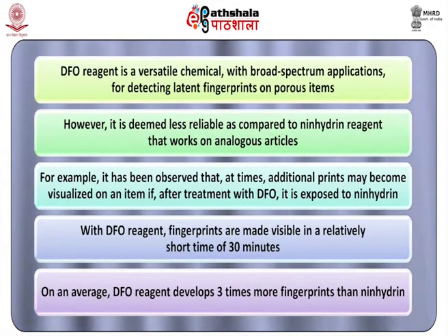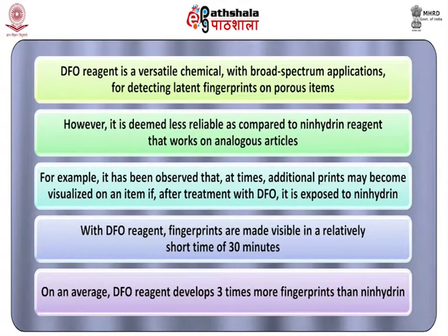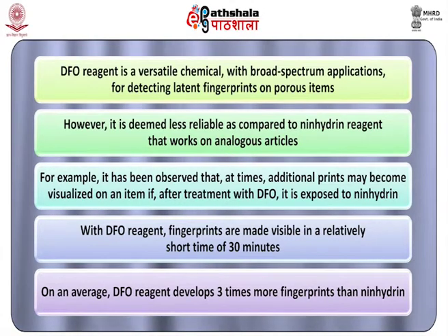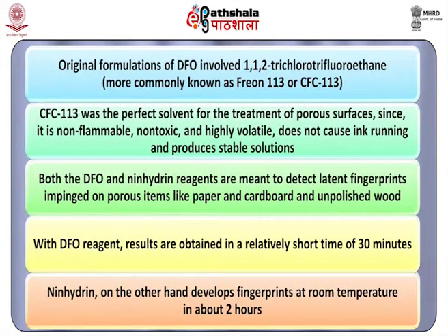Then we have come to know that with DFO reagent, fingerprints are made visible in a relatively short time of 30 minutes. And we have learned that on an average DFO reagent develops 3 times more fingerprints than Ninhydrin. The original formulation of DFO involved 1,1,2 trichlorotrifluoroethane, more commonly known as Freon 113 or CFC 113.